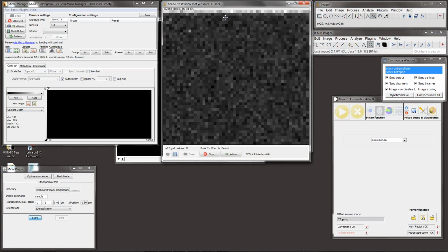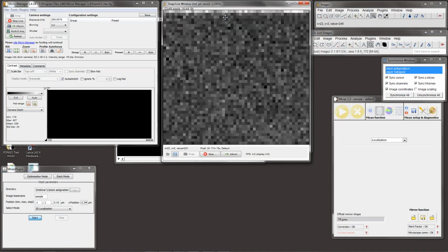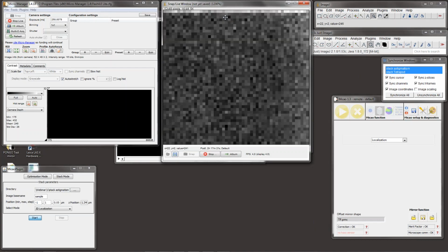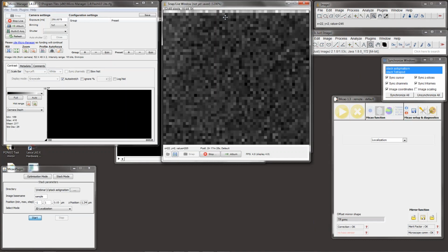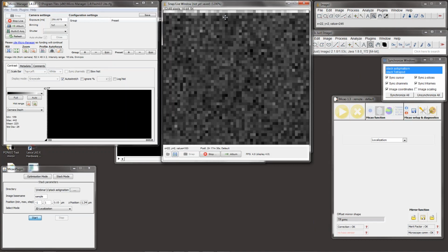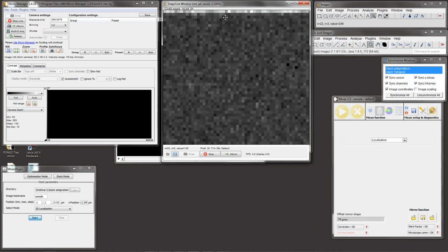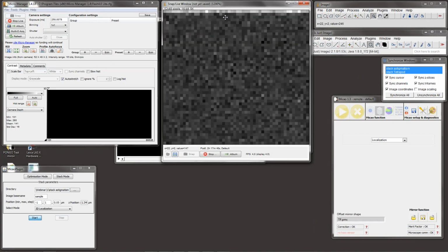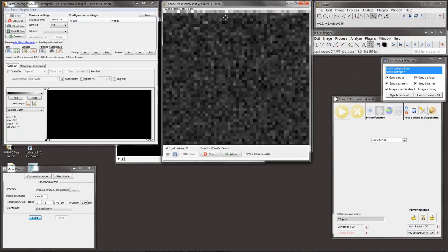That's a very good question. So yes, that's correct. When we run the optimization, it's obviously optimized for this area in the field of view. Now the aberrations will be pretty much the same all over the field of view. And that's even more true in single molecule localization microscopy, where we typically use a smaller field of view than, for instance, in confocal or wide field. But yes, it's optimized for one field of view. Typically, we choose a sample in the center of the field of view, and on the very edge, yes, you can find field distortion and other things like that.